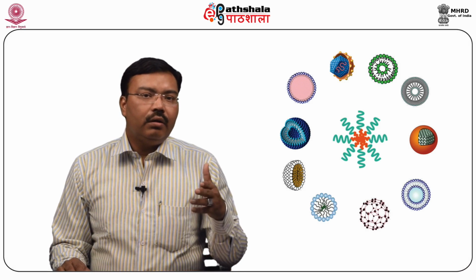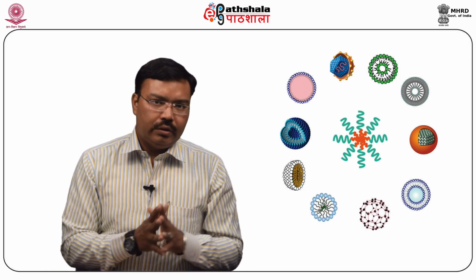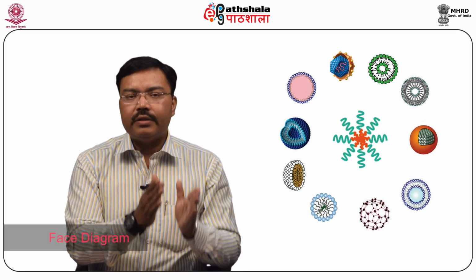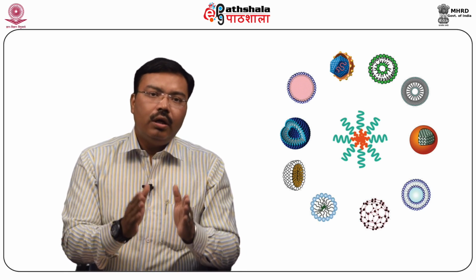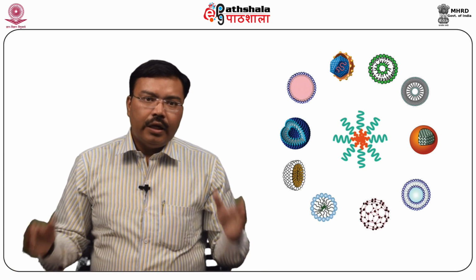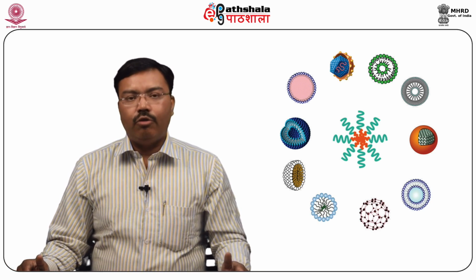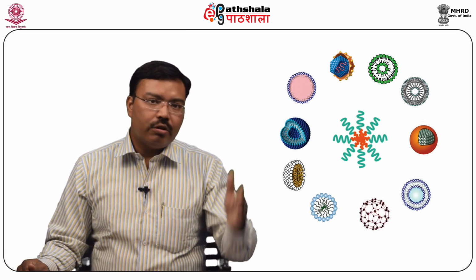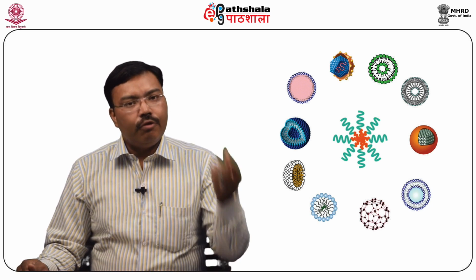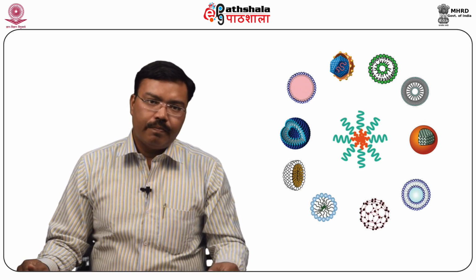To begin with these characterization techniques, it is very important to know how the samples of pre-concentrated microemulsion or reconstituted microemulsion are treated. The pre-concentrated microemulsion is a sample which does not contain water. It is only a concentrated microemulsion consisting of oil phase, surfactant and co-surfactant mixture.